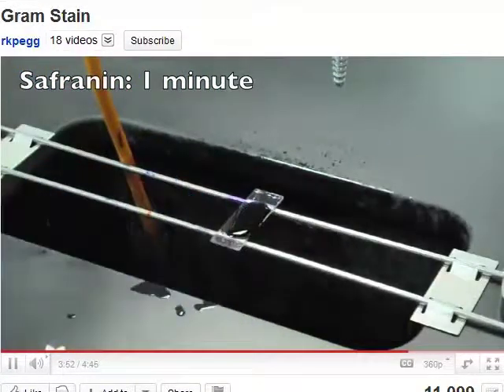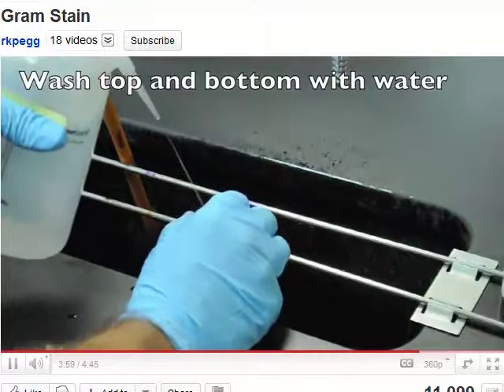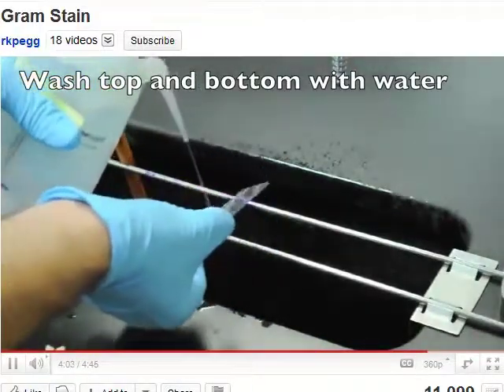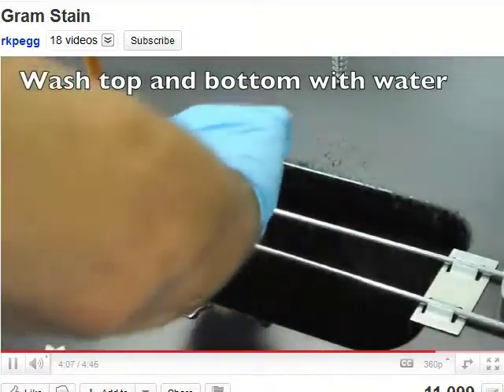And then finally, we want to use a counter stain, which is safranin, which is left on for 60 seconds. And again, safranin stains everything. So gram-negative cells, which were decolorized, will now be stained with the safranin. Again, washing the back of the slide and washing the front of the slide.